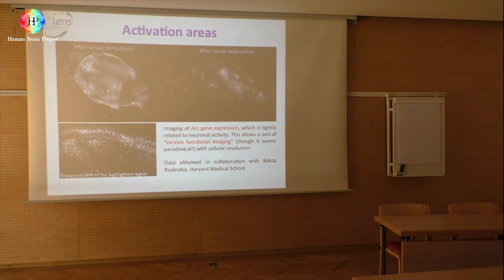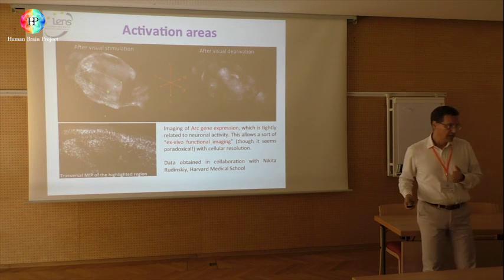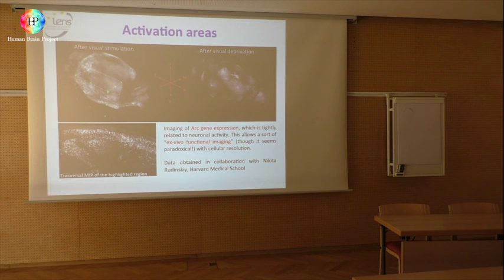And then, of course, you can use other things like transgenic mouse that, during an activity, when they are exposed for 1 hour to an activity, the cells which are activated become fluorescent. Then you sacrifice the mouse after 4 hours, and then you make a map, like an fMRI map. It's ex vivo, of course, but with a voxel resolution 1 billion times higher than fMRI. So it opens up completely a new field in determining, let's say, on the whole brain, the functional maps.